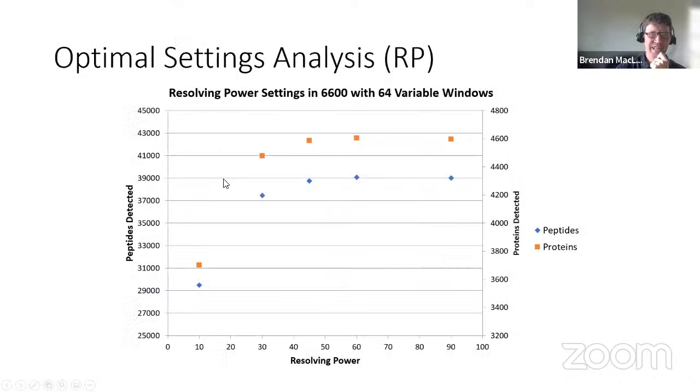And the way I got there actually was, I started out pushing data through Skyline and realizing, whoa, wait a second, 30,000 resolving power is way better than 10,000 resolving power. I could see that right off.